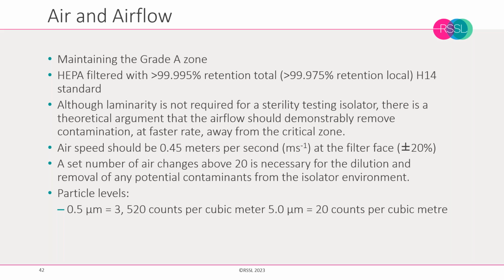And we also need to ensure that our HEPA filters are running correctly, which you're going to mention at the beginning. And if we are requiring unidirectional airflow, which tends to be typical for an aseptic processing isolator, but less typical for a sterility testing isolator, that's an important concept and an important contamination control principle.